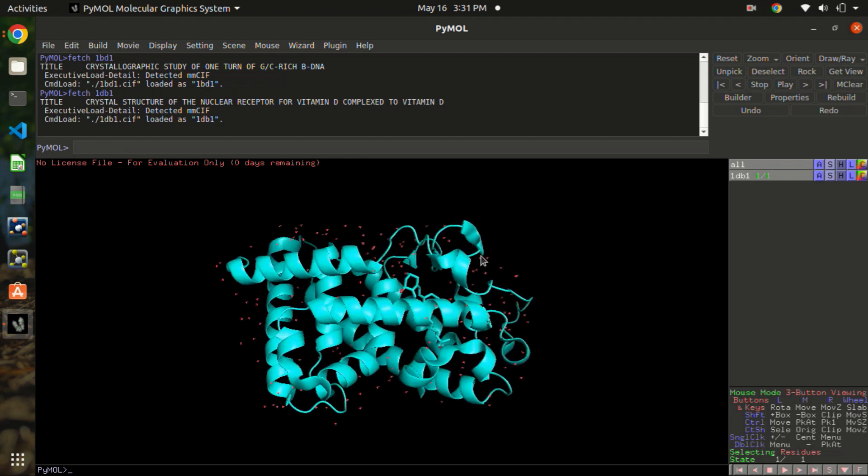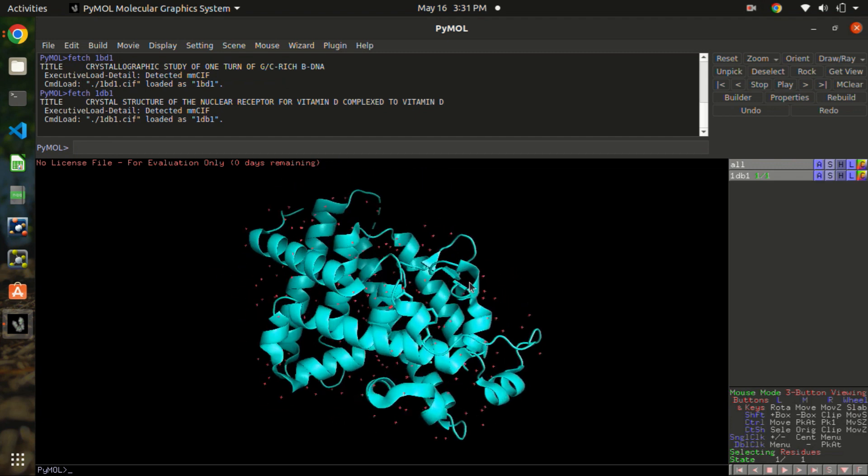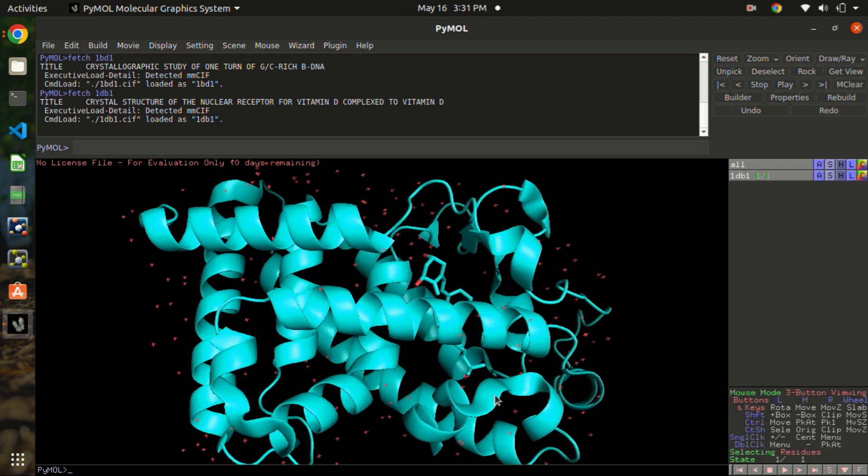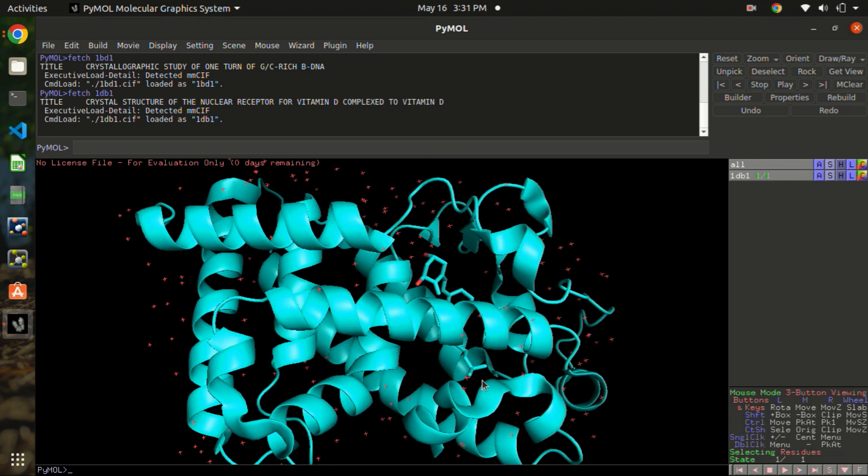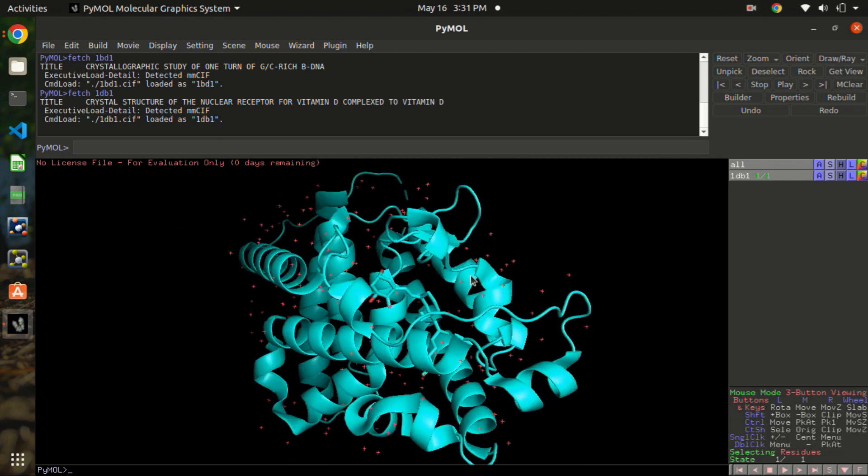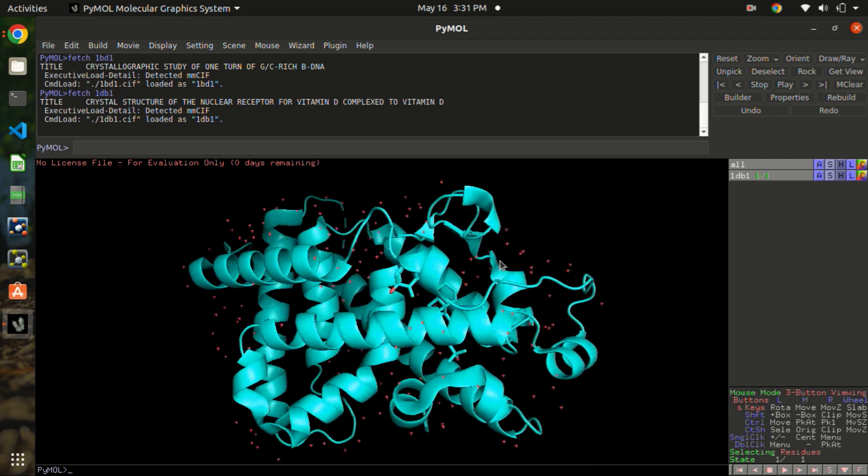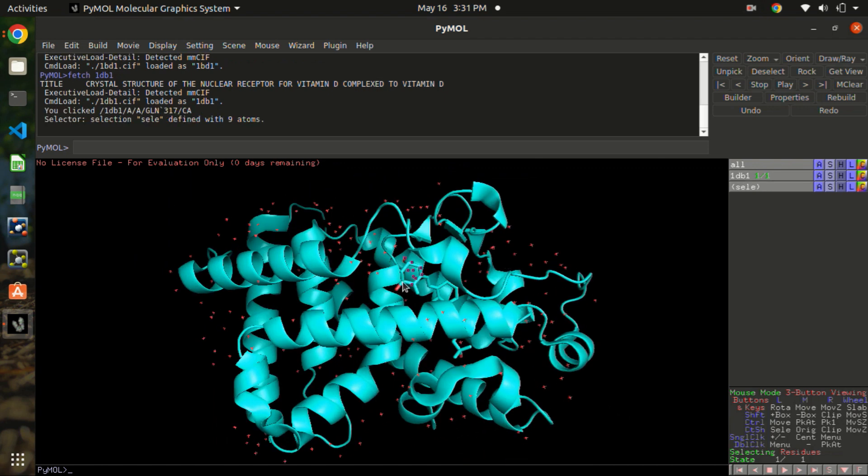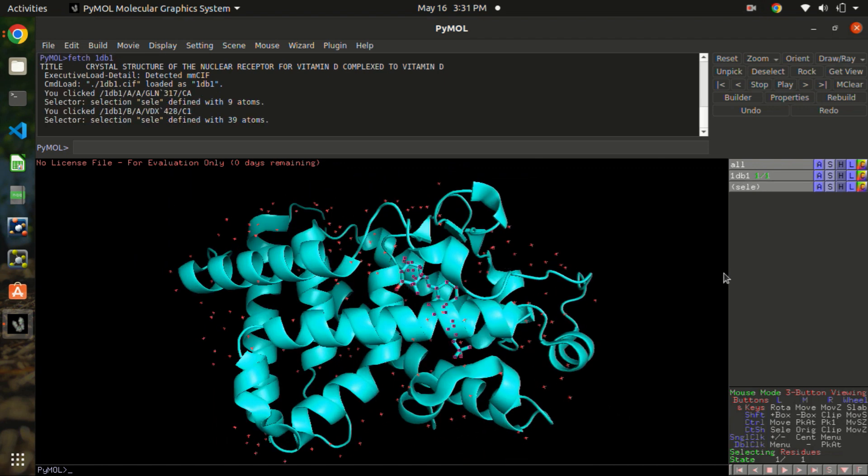So we have this structure and we have a ligand inside it. What we are going to calculate is the binding pocket volume only. So at first, let's select the ligand here. Just the ligand.